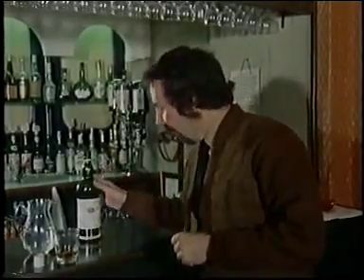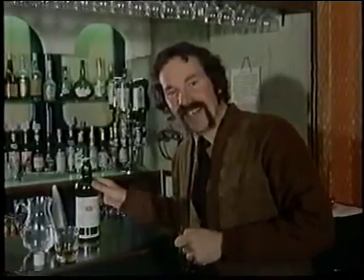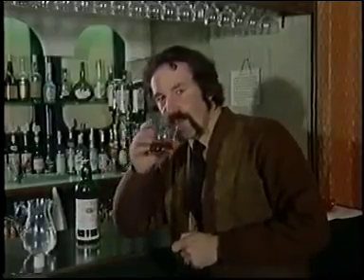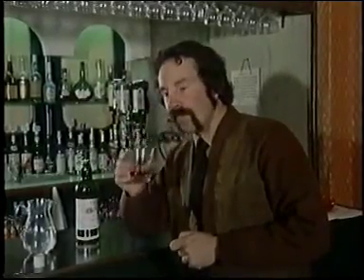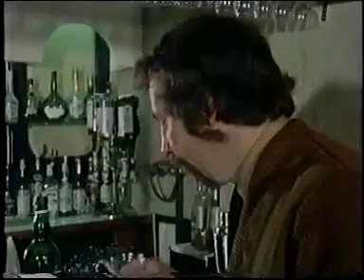So far, we've only talked about organic solids. But here we have a familiar organic liquid, the aristocrat of organic liquids, some would say. To get from the raw spirit to this state, we need to purify it. Particularly, we have to separate from it that most serious contaminant of organic liquids, water. Clearly, a separating funnel is no good here. We need a different technique, distillation.